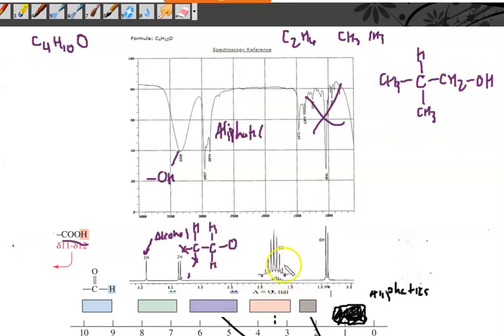So this big peak here says I have 1 hydrogen. It's down underneath 2, so it's aliphatic. And when I say 9 peaks, that means it's 8 hydrogens. How in the world can I get 8 hydrogens? The only way is a CH3, a CH3, and a CH2. So that 1 peak actually gave me 90% of my molecule, everything except for the oxygen and the hydrogen. Notice that fragment matches that fragment.